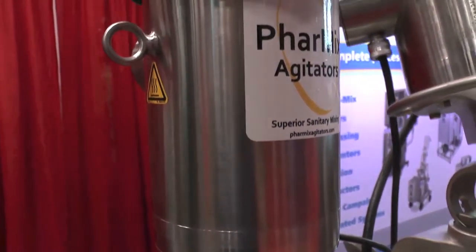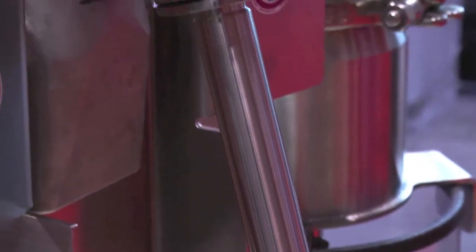Integrated agitation controls and all stainless steel NEMA 4X enclosures can be onboard or remotely mounted. A complete pre-validation documentation package is provided with each unit, including standard certificates of conformance for metallic materials, seal faces, and elastomers.